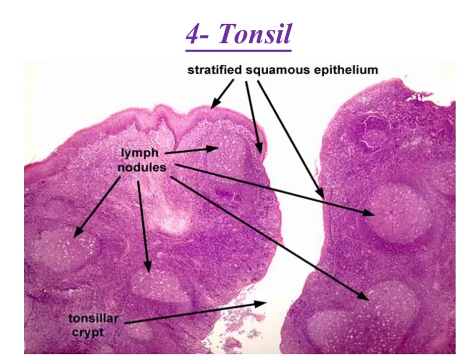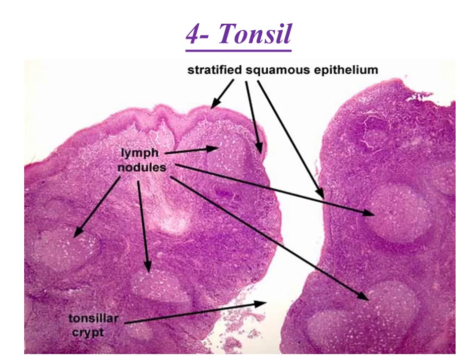This is a picture of the tonsil. The tonsil is characterized by having a covering of the mucous membrane lining the oral cavity, which is formed of non-keratinized stratified squamous epithelium. This epithelium dips into the crypt and lines it also. On the other side it has an incomplete capsule. So from one side we have the non-keratinized stratified squamous and at the base we have the incomplete capsule.